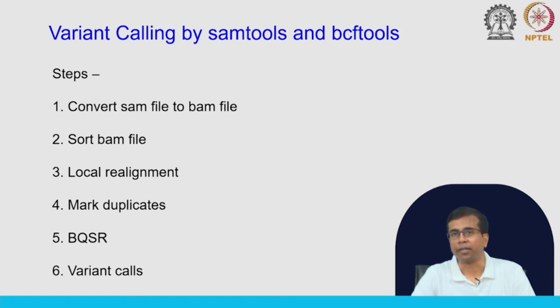It is a time consuming step, so it is not possible for us to cover it or do hands on in this class, but we discussed the idea of why we do this, and I also mentioned the software that will do this for you. And then the final variant call is the actual step where we identify those variants.